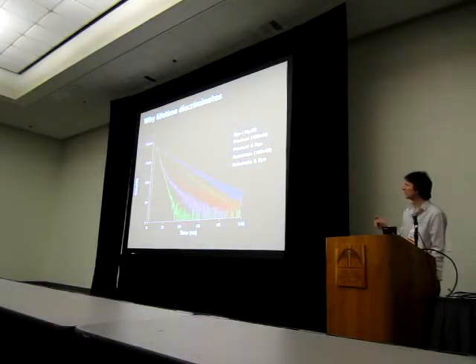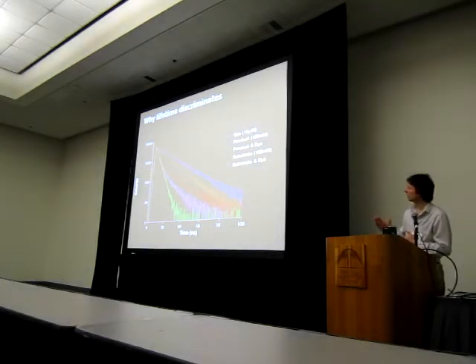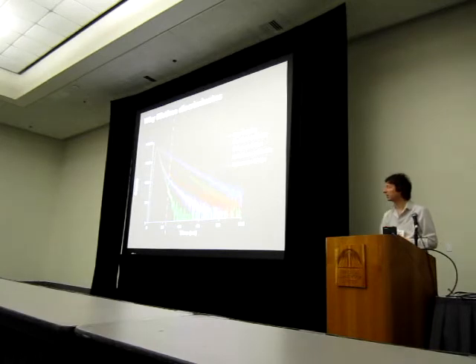The other two lines, which I just need to explain then, are the red line and the violet line. The red one is a mixture of the product peptide and the dye, and the purple one there is the substrate and the dye. So you can see actually that those two curves that sit between the other three look like they're superpositions of a pair of straight lines in each case. And in fact, that's exactly what they are. Now, you can use that information.